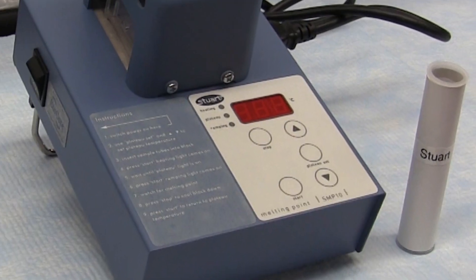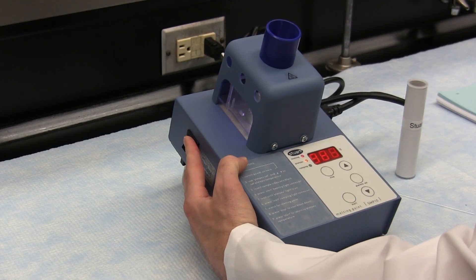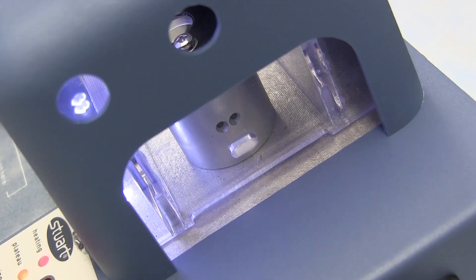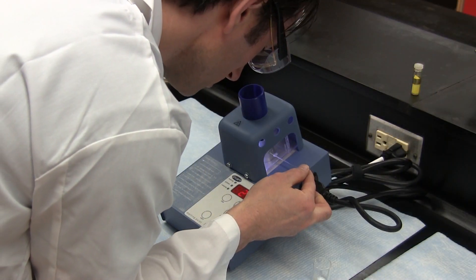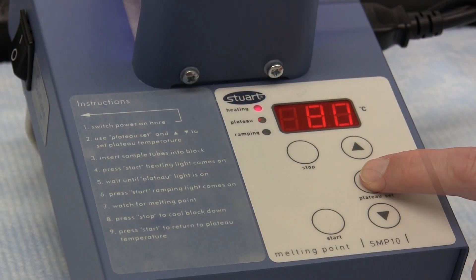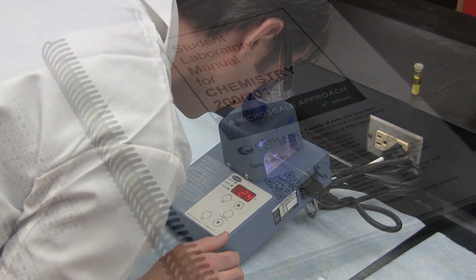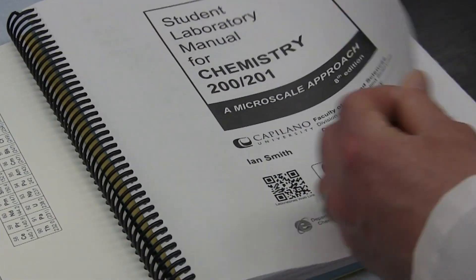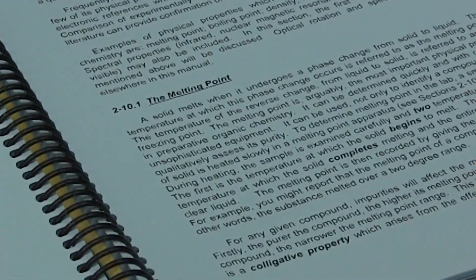This video provides some basic information on how to use the Stuart SMP10 Digital Melting Point Apparatus. You can probably derive the greatest benefit from this video by first familiarising yourself with the basic concepts of melting point determination as they apply to preparative organic chemistry. If you haven't already done so, you should read the related material in section 210 of your lab manual.